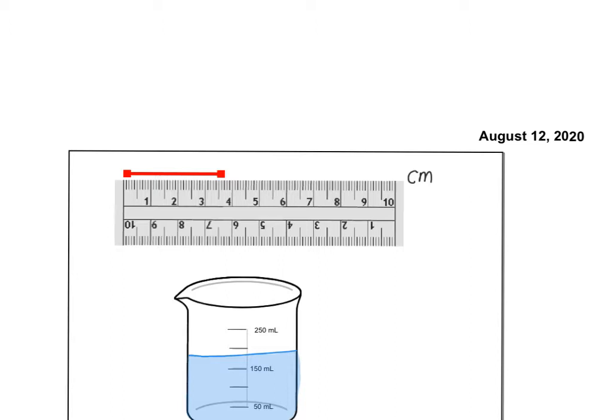All right, let's practice. So the first one, I have a centimeter ruler, and we're going to measure the length of this red bar. So remember, we record all certain digits. So can we all agree that this red bar is at least 3 centimeters? It's between 3 and 4. So I am certain, because there is a marking on the device, for 3. I am certain that it is at least 3, so I'm going to write that down.